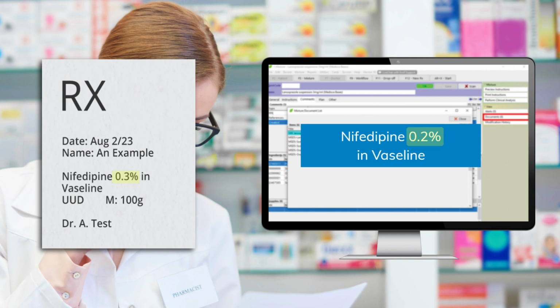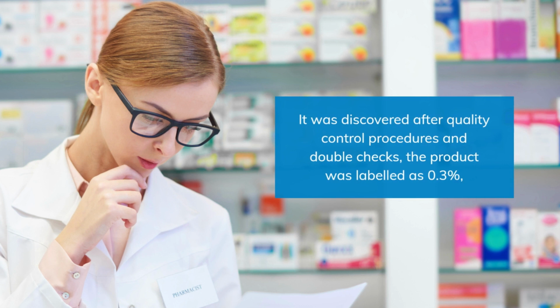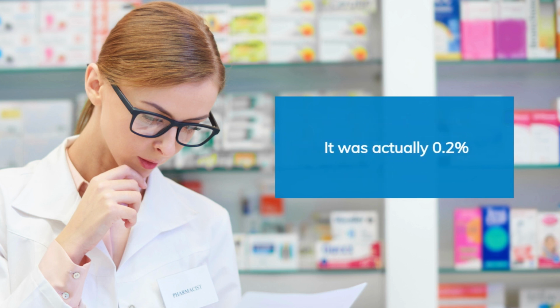Staff used the 0.2% file and MFR as a guide to develop the 0.3% file and MFR. When the pharmacist conducted the quality control procedures and performed a double check on the calculations, they discovered that although the compound was named correctly as 0.3% strength, the quantities were not updated and equated to just 0.2%.